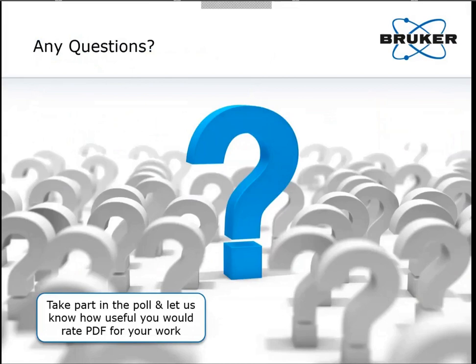Yes, and that's the flexibility of a system like that, and in a detector like the Eiger, that can be used both as a 1D and a 2D detector. If I had the choice, I would generally choose to operate the detector as a 1D detector. And the reason for this is rather simple. It's essentially because if you have a line-shaped X-ray beam hitting your sample, you have a lot more X-rays hitting your sample, and you have a lot more of your sample being illuminated by X-rays. So essentially, the intensity is a lot greater. Rather than using, let's say, a point source hitting a very small portion of your sample, then your intensity will be lower. So given the choice between the two, I would tend to opt for a line-shaped X-ray beam and measuring in 1D.